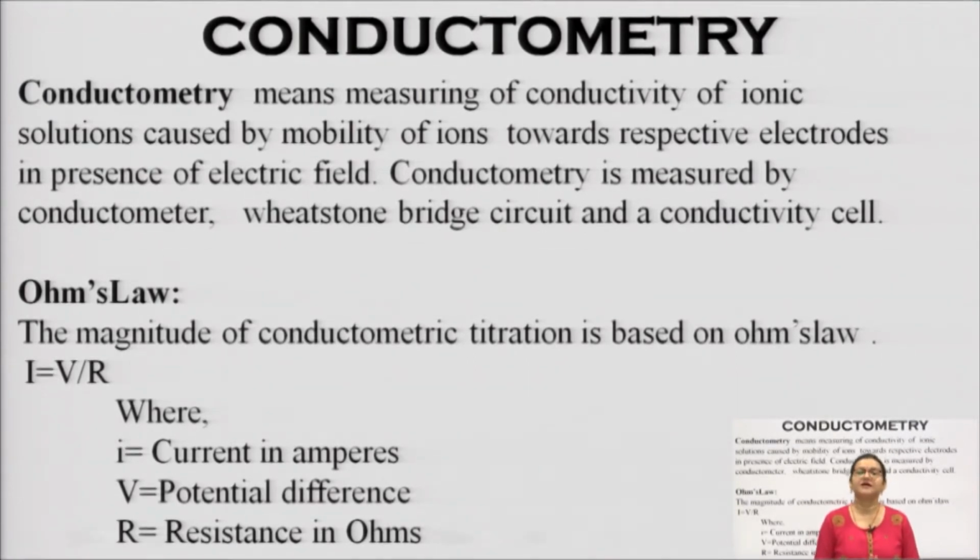Ohm's law says that when an electrolytic solution is kept in an electric field, the generated current inside the electric field is directly related to the voltage generated across the electrodes, which is directly proportional to the conductance of the charged ions or charged particles of the analytical solution, or test solution, under study.